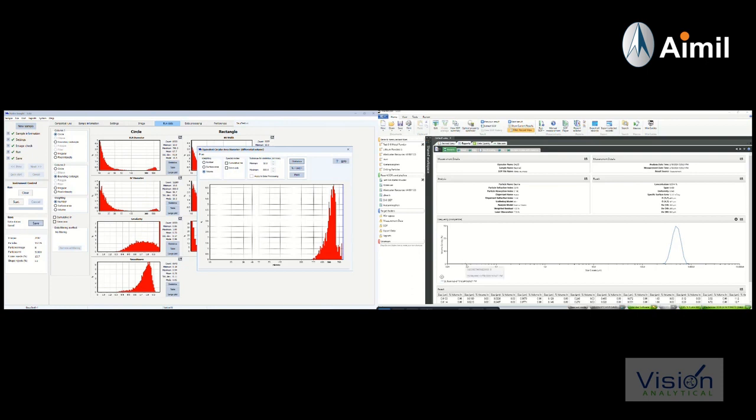What is interesting though is in laser diffraction there is no scattering, no reporting of particles below the main peak, whereas when you look at the number weighted distribution for image analysis, there are a large number of particles in the smaller size range. Neither one is wrong. The reason is because of the volume weighted distribution, and the weak scattering intensity does not allow laser diffraction to see these particles. These particles are actually there.